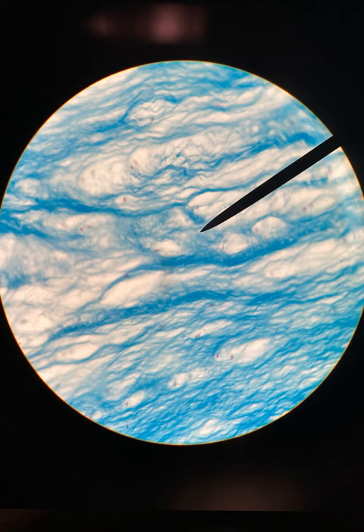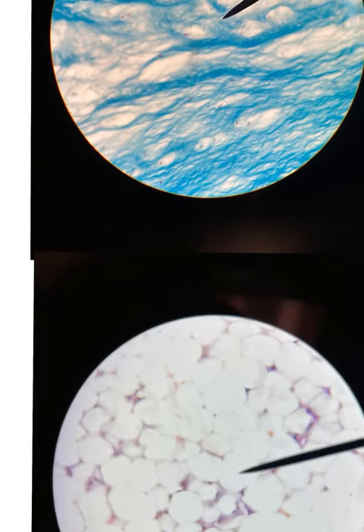Now, a very big point, the reason I included this slide, I'm going to include another slide at the end that is also fibrocartilage, because I don't want you to memorize the color. The color is not what you're actually looking at. The color is just whatever they use to stain it with. It could be any color. So I really want you to pay attention to the fact that these have the chondrocytes. You can sort of see this wispy appearance.